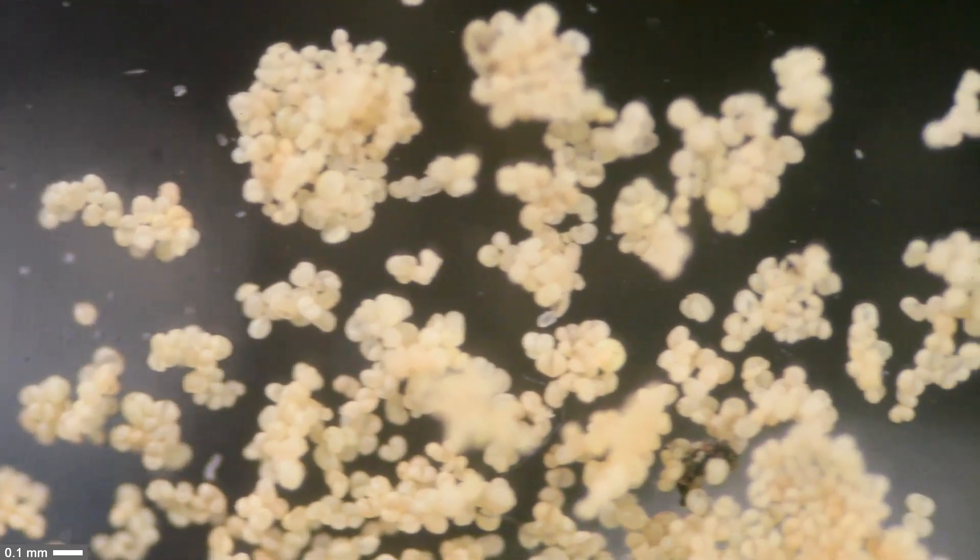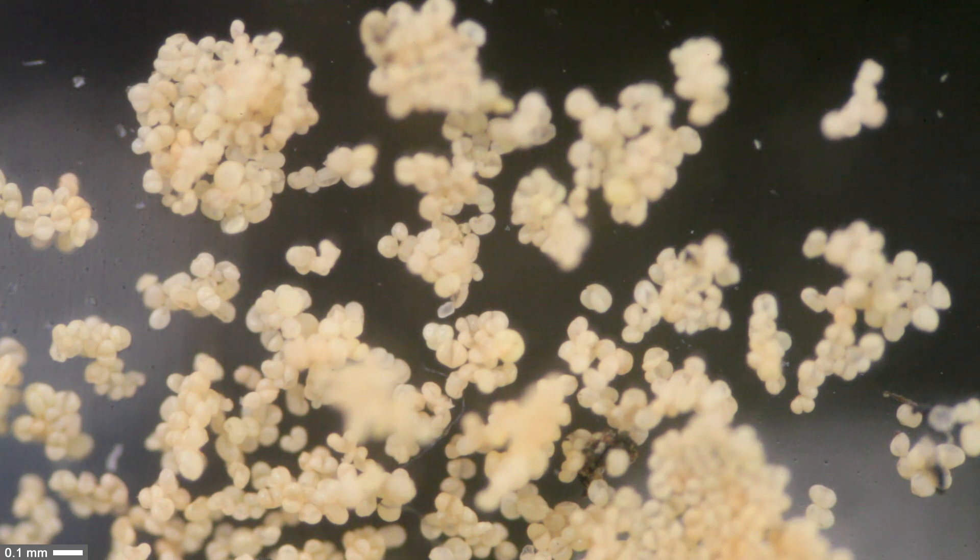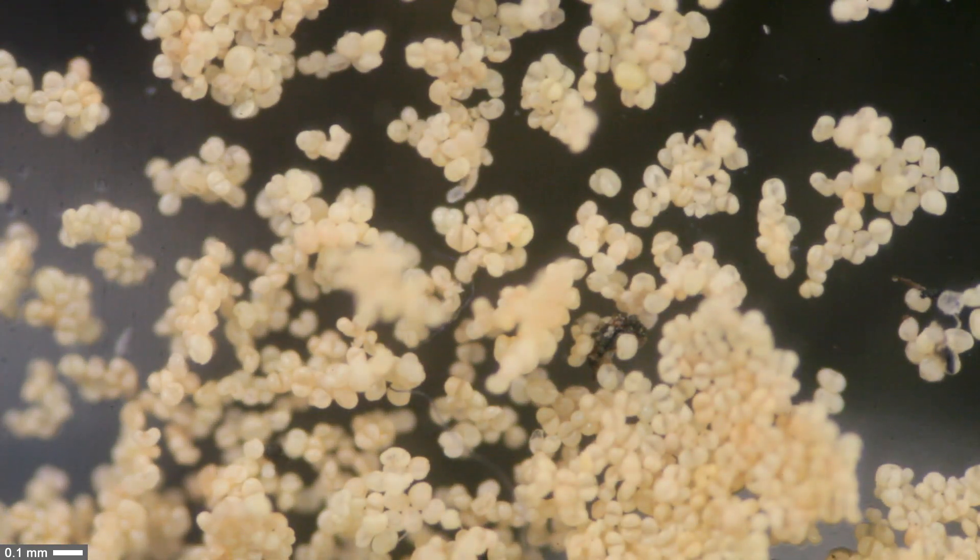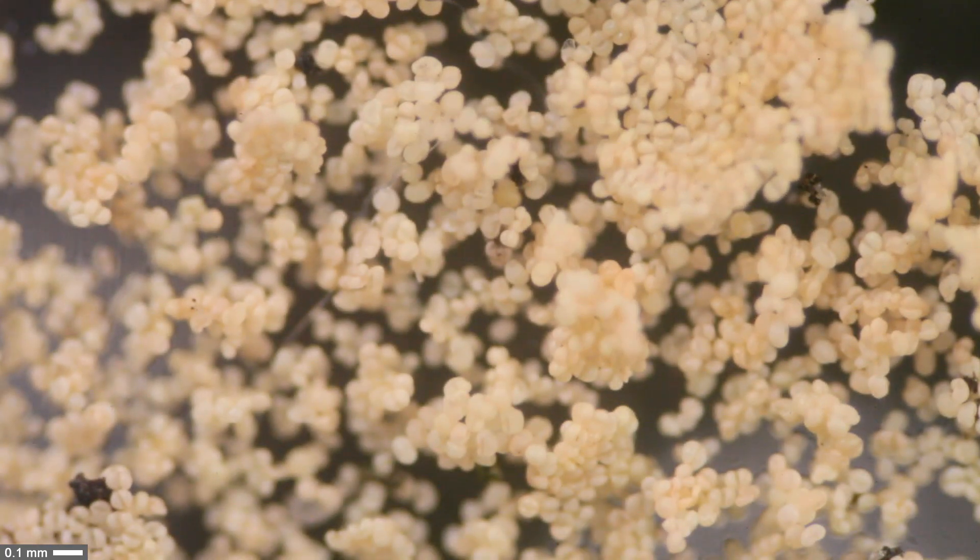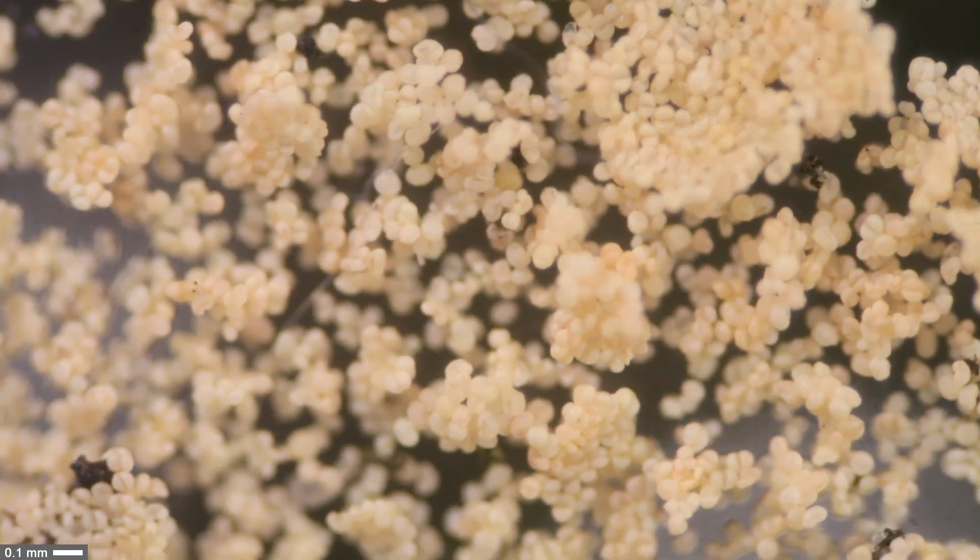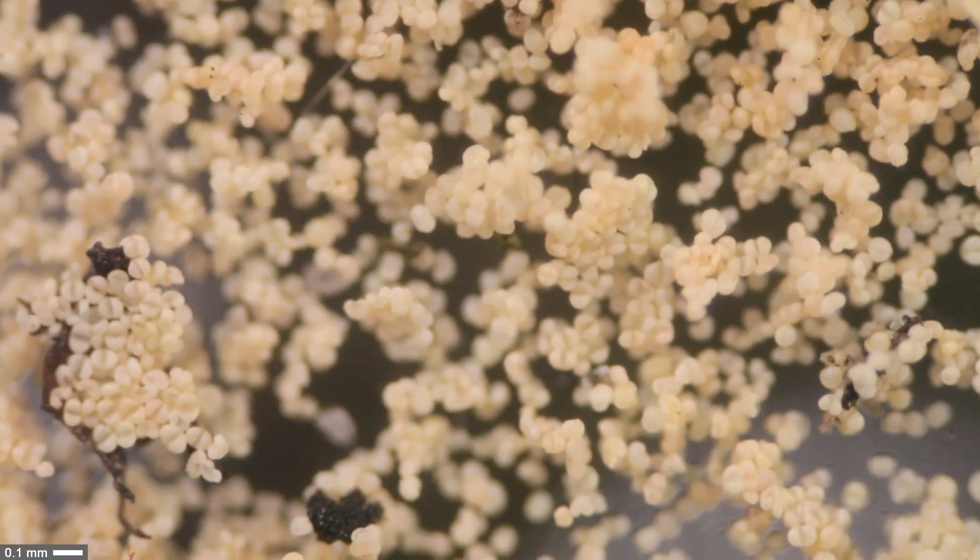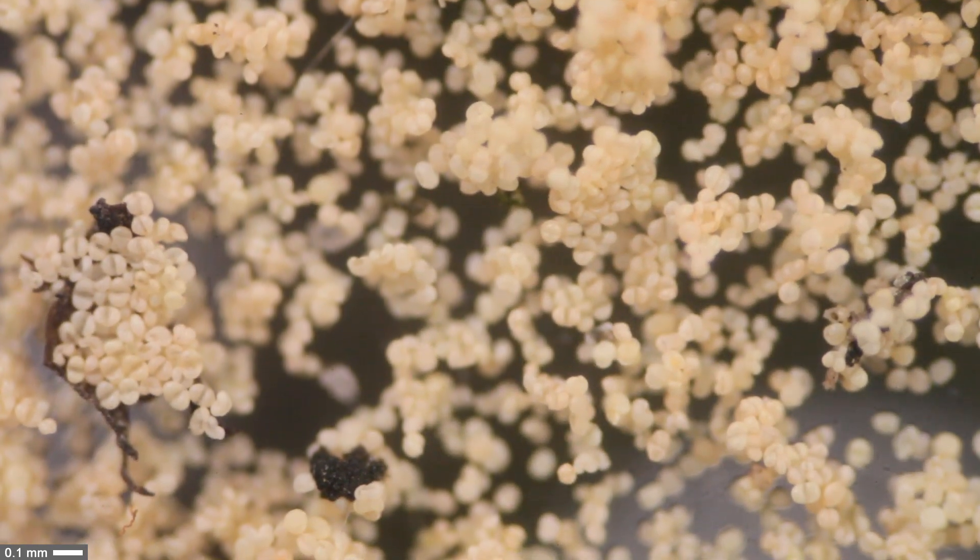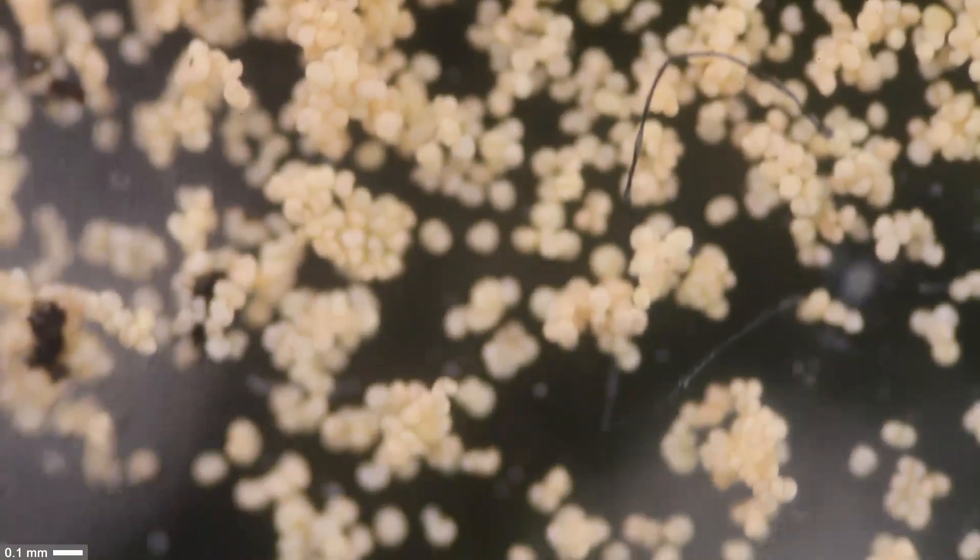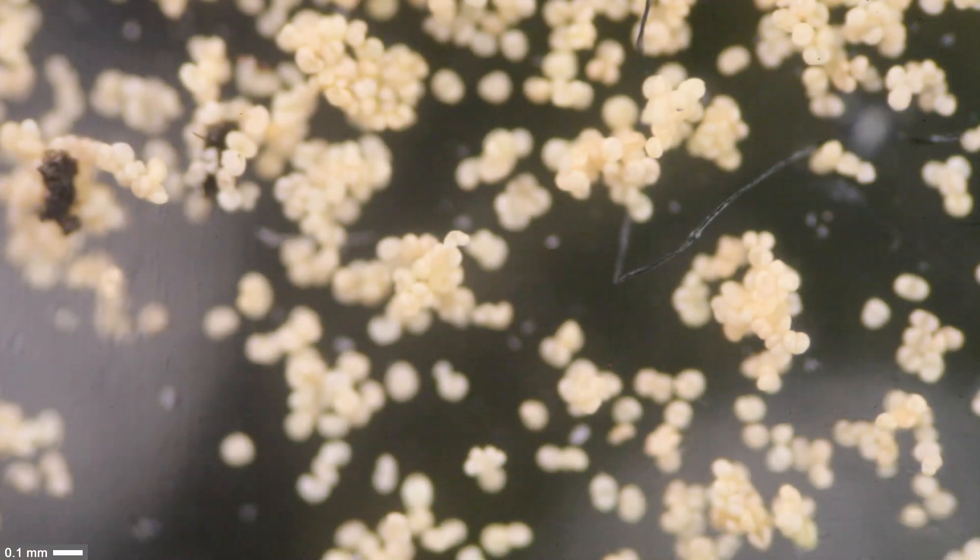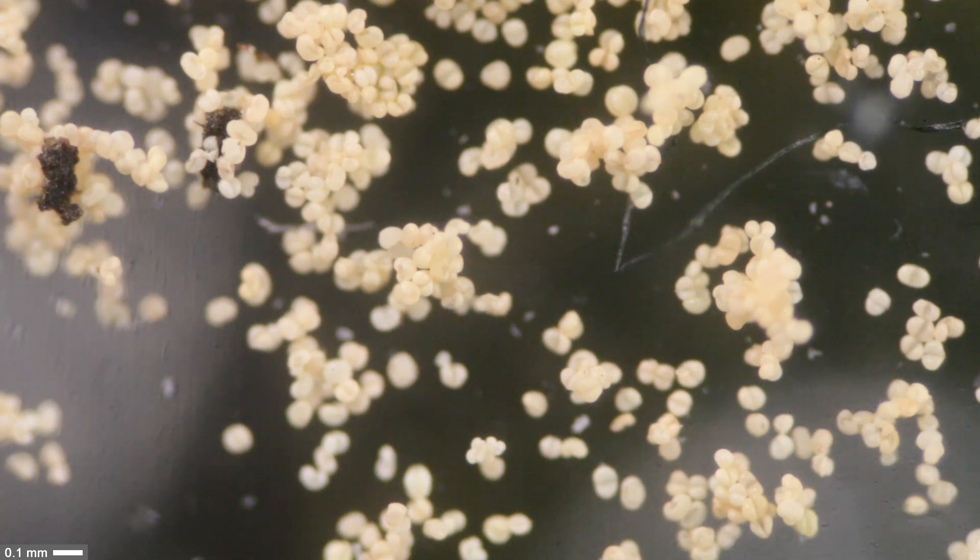Individual pollen grains can be seen better because they're casting shadows. You can see much better that they're stacked on top of each other, along with some dark tarmac from the road and string-like structured dust.